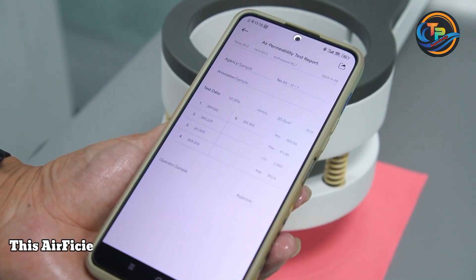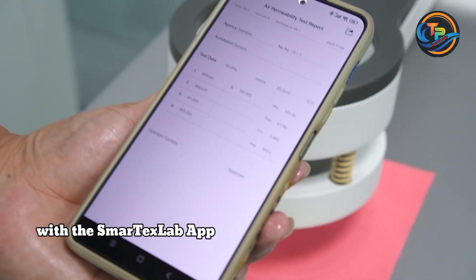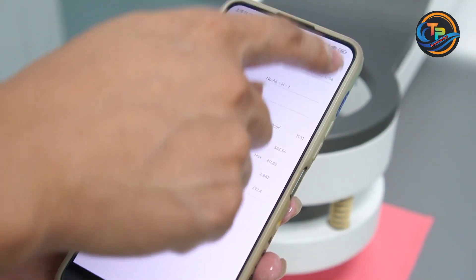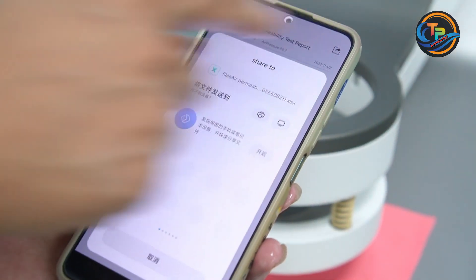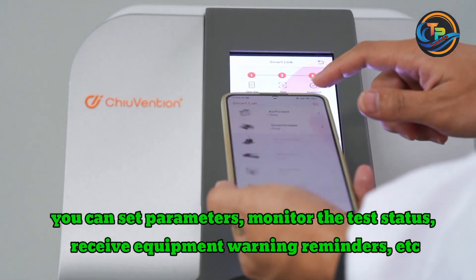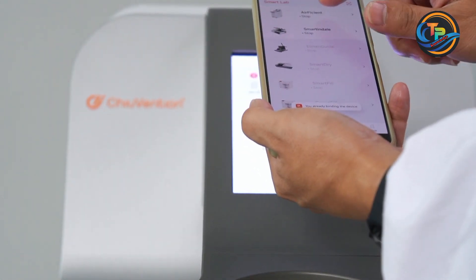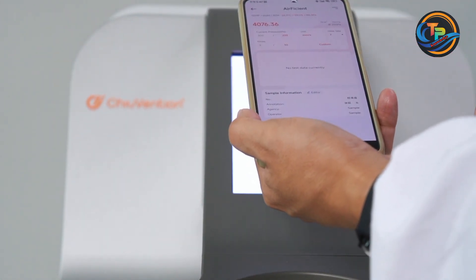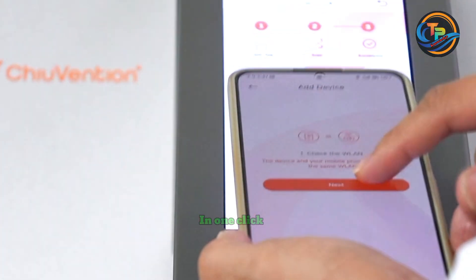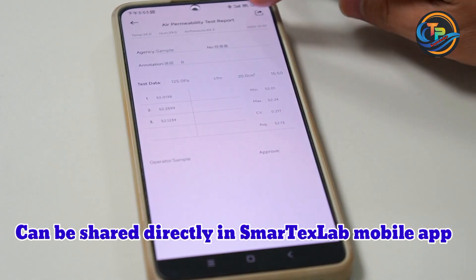This Air Permeability Tester can be connected through Wi-Fi with the SmartTex Lab app installed on your smartphone. You can set parameters, monitor the test status, receive equipment warning reminders, and share the air permeability test results with the quality control department or brand buyers — in one click, shared directly in the SmartTex Lab mobile app.